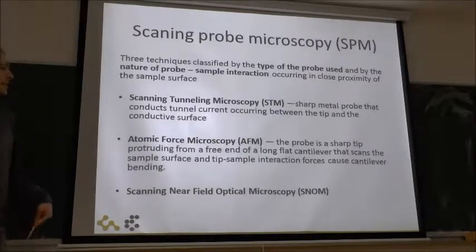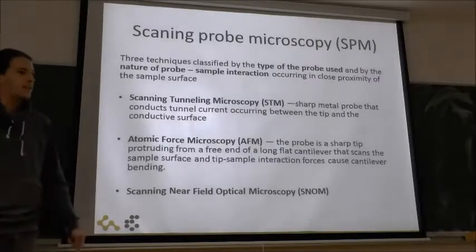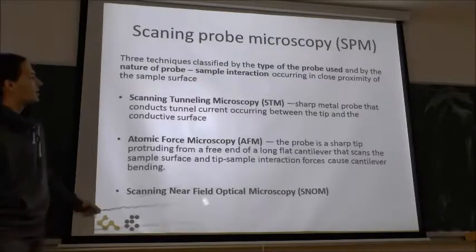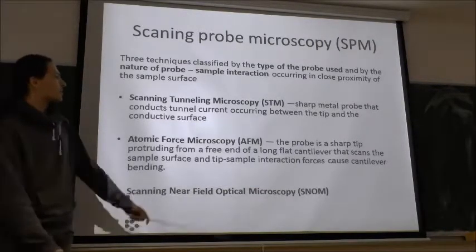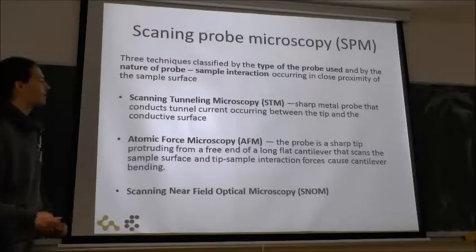We have the scanning tunneling microscopy. It was invented in the 1980s, where we observe the tunnel current between the sharp metal probe and the conductive sample. They won the Nobel Prize for the STM.